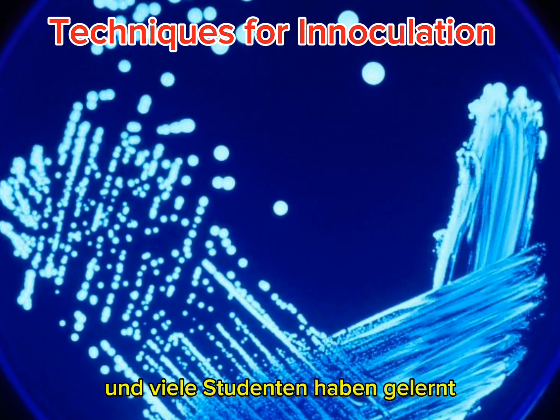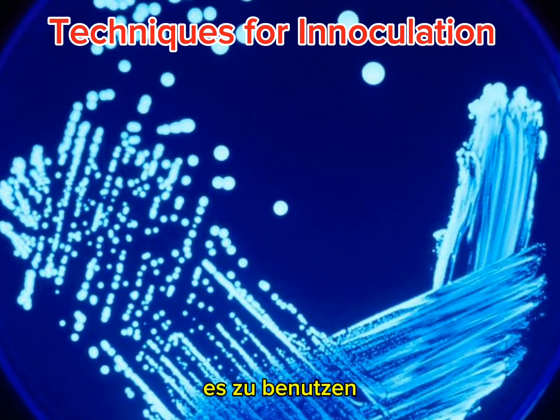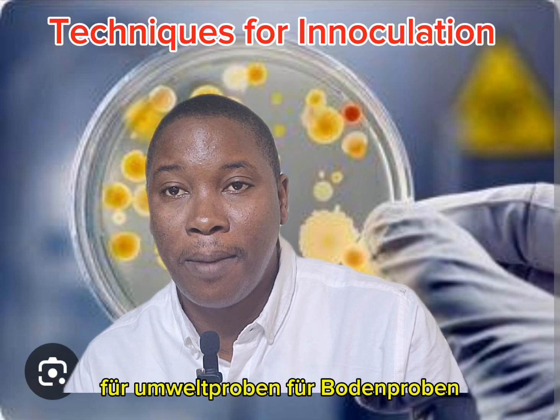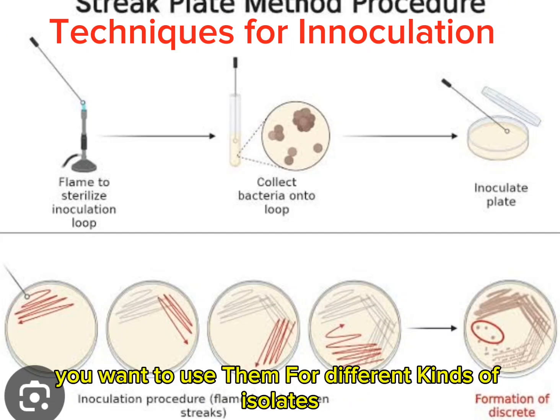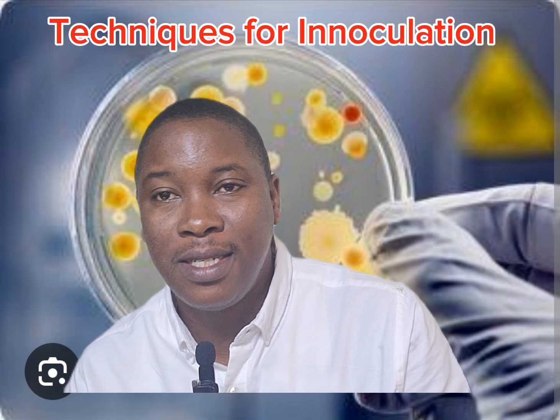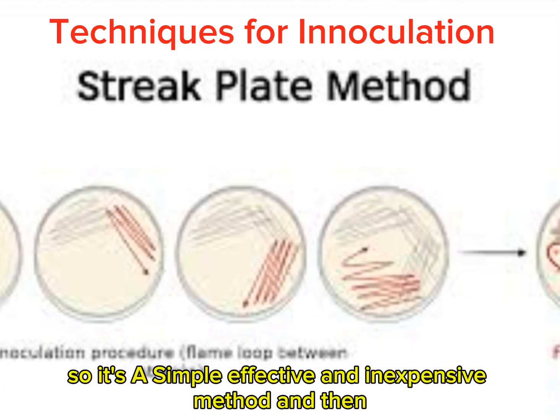A lot of students have learned how to use it, and it's very important to use. You want to use it for food samples, environmental samples, soil samples, clinical isolates, and different kinds of isolates. It's a simple, effective, and inexpensive method.